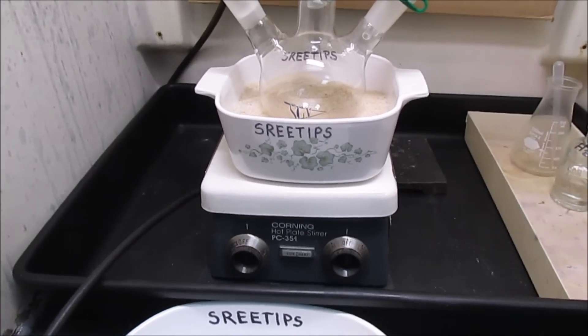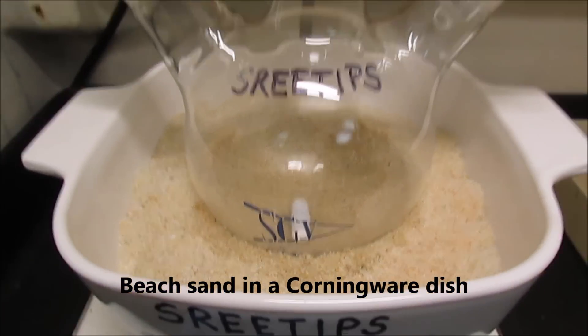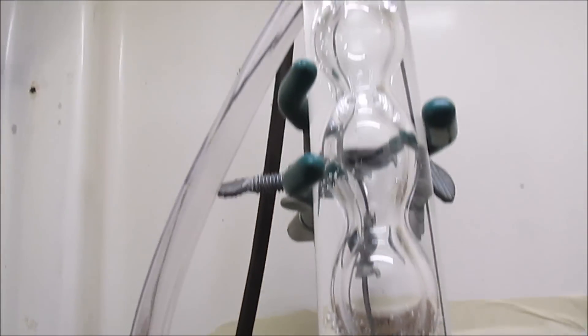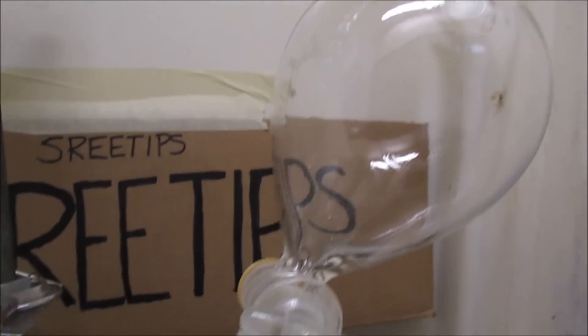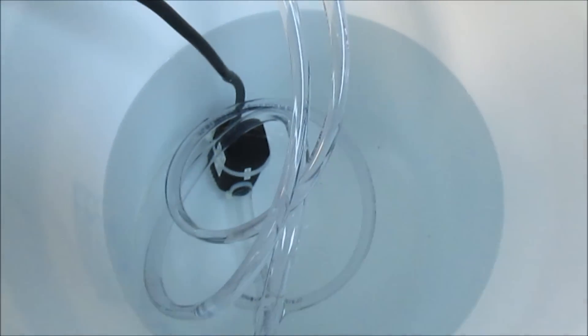Before I anneal the platinum, I want to show you the setup I've got here. I've got a hot plate stirrer with a stir bar inside a 500 milliliter round-bottom boiling flask with three necks. I've got a connection to add solids or chemicals, a reflux condenser to keep hazardous fumes in the reaction vessel, and an addition funnel so I can add nitric acid. A pond pump takes water from a bucket, feeds it up to the condenser and back down. I'll be adding ice to keep it nice and cool.